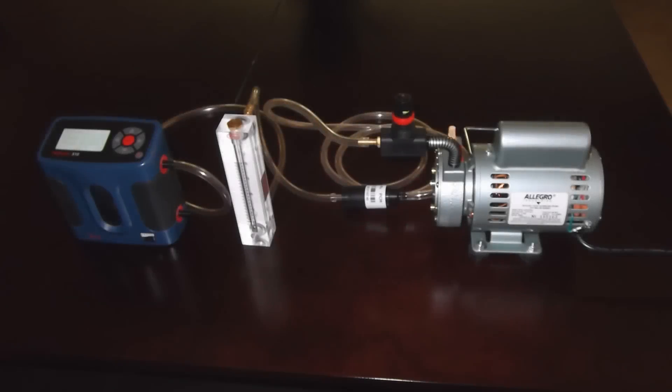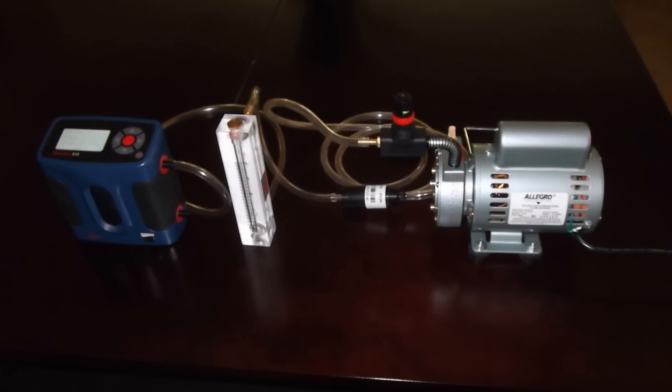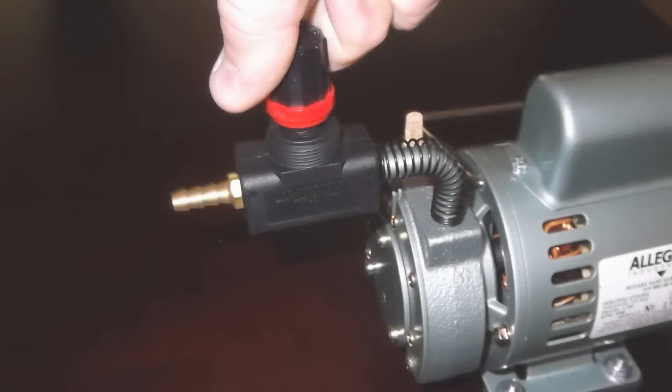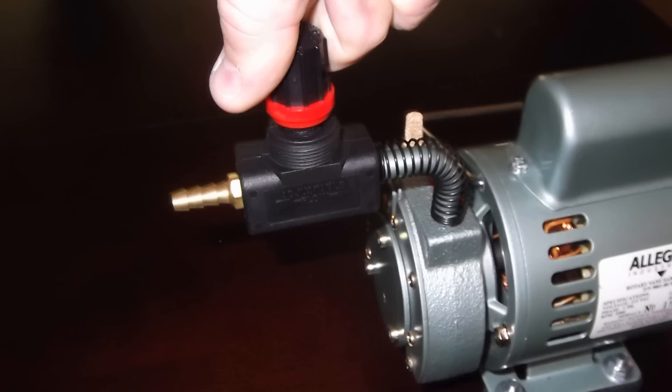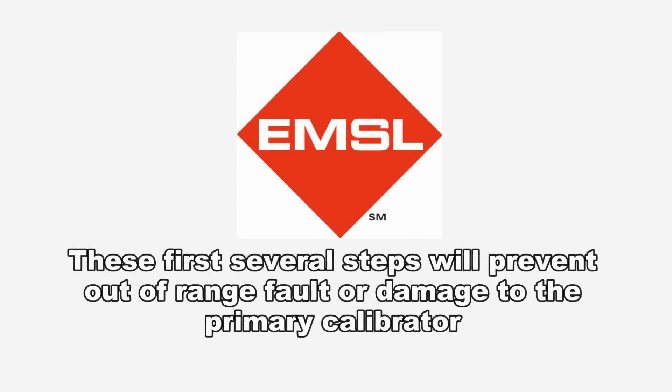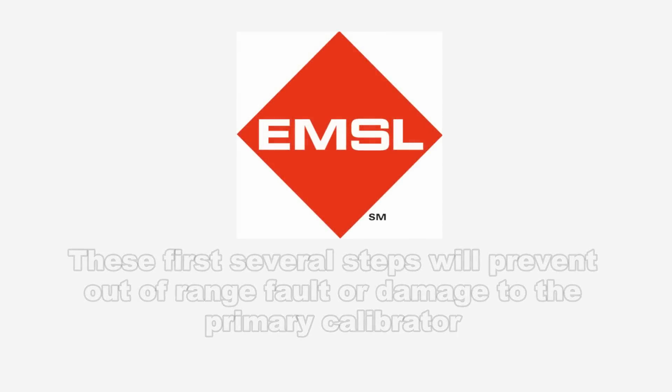To perform primary calibration of a rotometer and high volume sampling pump, first plug in the pump but do not turn it on yet. Then turn the adjustable flow valve all the way down clockwise. Once the adjustment knob on the flow valve is flush, turn the knob three full turns counter clockwise. These first several steps will prevent any out of range fault or damage to the primary calibrator.